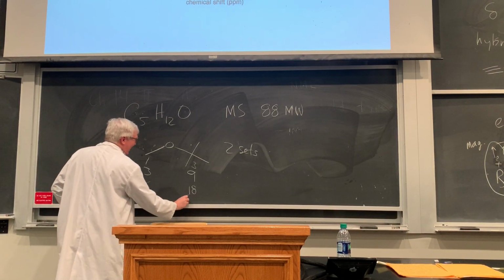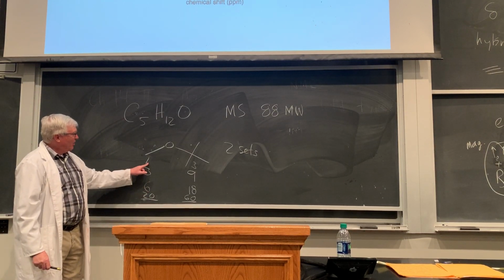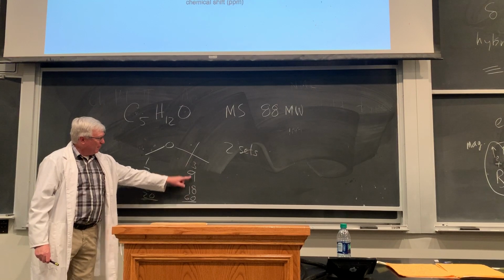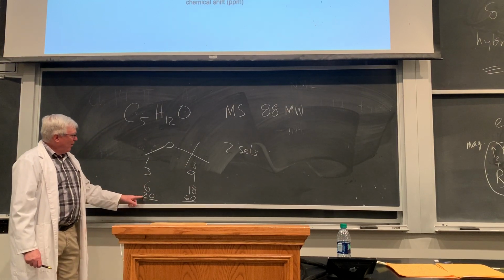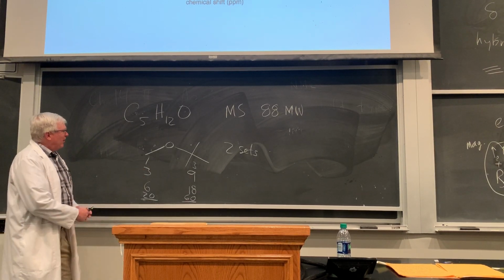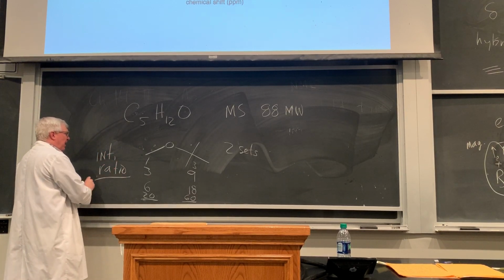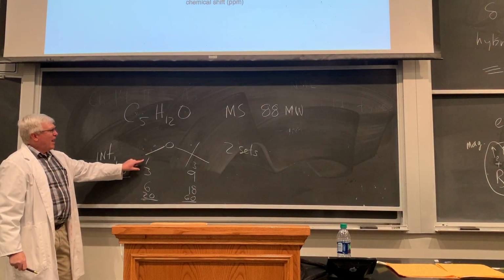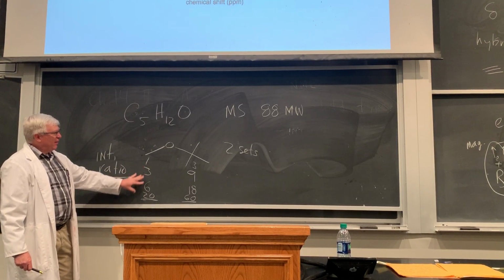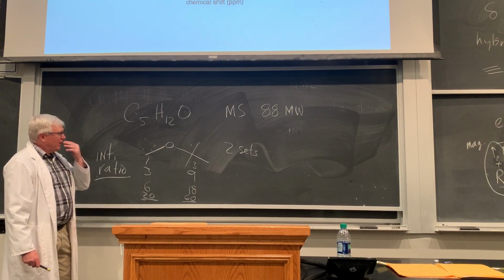For the data here that came out of this experiment, it was what? 20 to 60. So what you can do experimentally, if you think that this one signal is just for one hydrogen, it might come out to 1, and then you divide this number, whatever it is arbitrarily, by 3, and you get down to 1 to 3, or if you divide by another number, you get to 3 to 9, whatever. You have to play around with this. What we get from the integration then is just the ratio. We have to have some idea of what the structure might be to apply the absolute numbers in those sets. Okay? You see that? That can be kind of tricky. It's kind of an arbitrary thing. We have to measure that carefully and experiment with that to see how we might arrive at that.